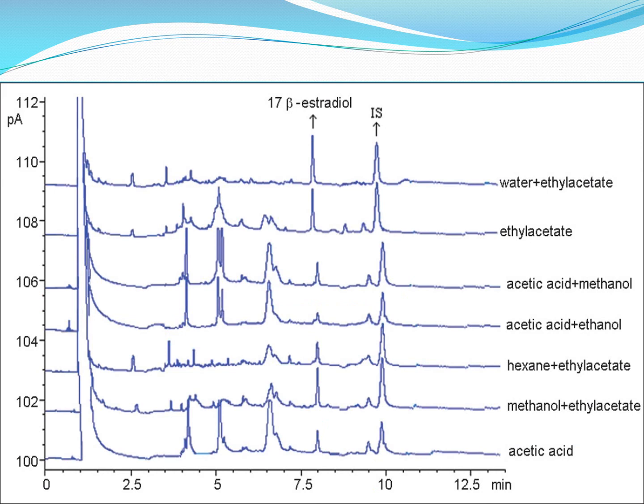This is a more realistic diagram that we can give as an example, and we can see the different materials present in our sample with its different curves.